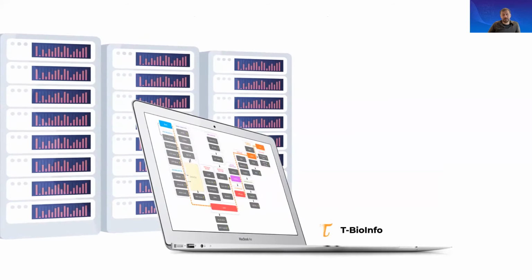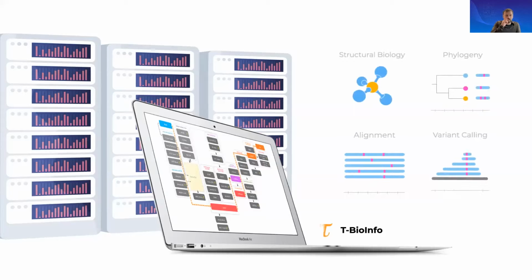How do we analyze this kind of data? What we will use throughout this platform, throughout this program, is a platform called the T-Bioinfo platform. This platform is going to link the concepts that we use for each step of the analysis with the outputs that we're going to perform downstream analysis with. And this platform combines many different types of analyses that we will use throughout this program.